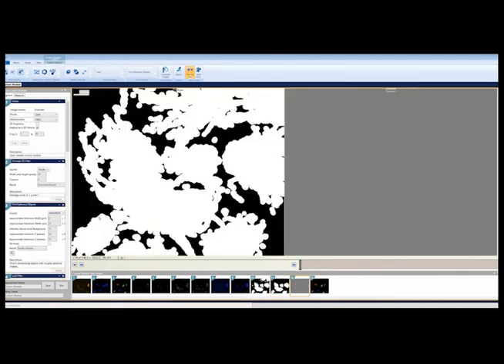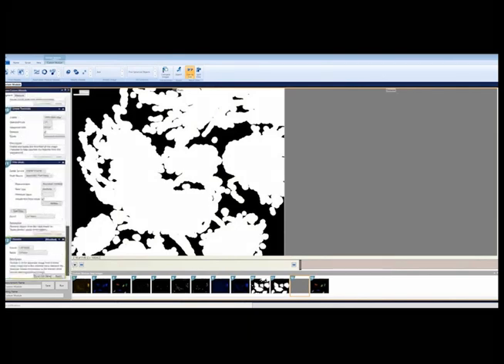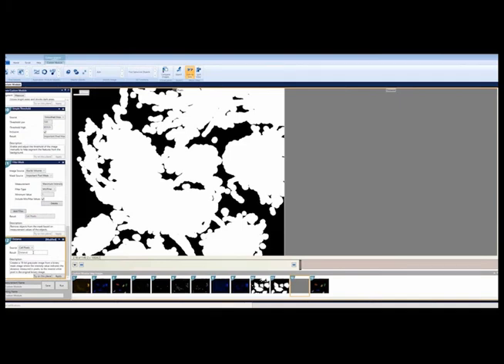Splitting the cells is the next big hurdle. To do that, we will use Watershed Lines, for which we need to gather two intermediaries. A representation of the nuclei we can use as a marker to generate exactly one cell per nuclei, and a second to generate intensity peaks between the larger cell pixel objects. We will start with this second image.